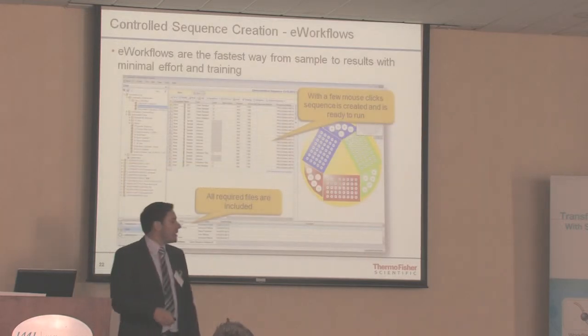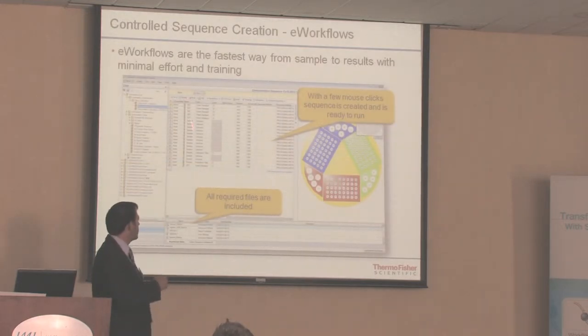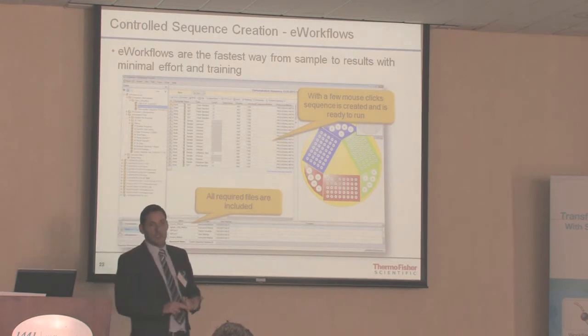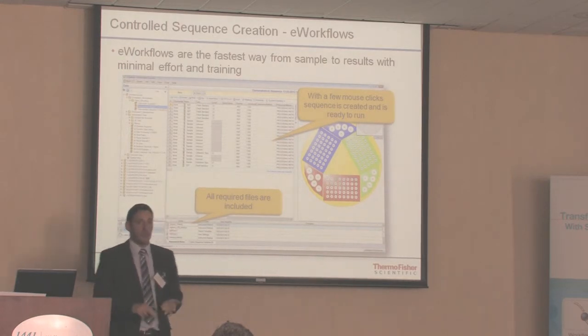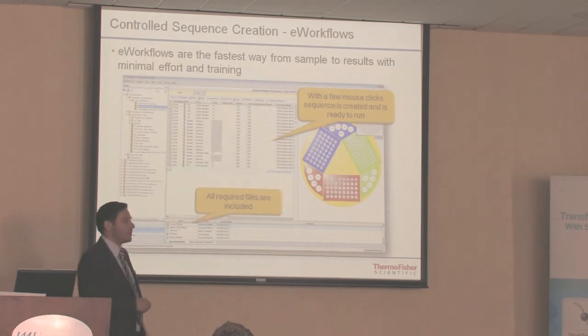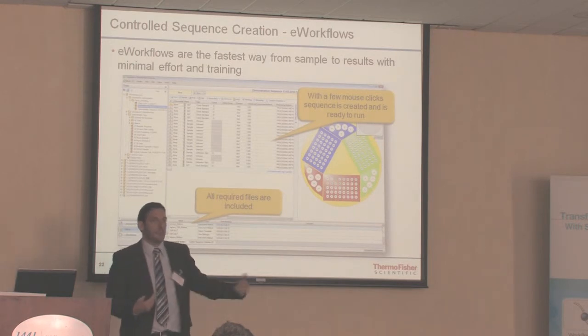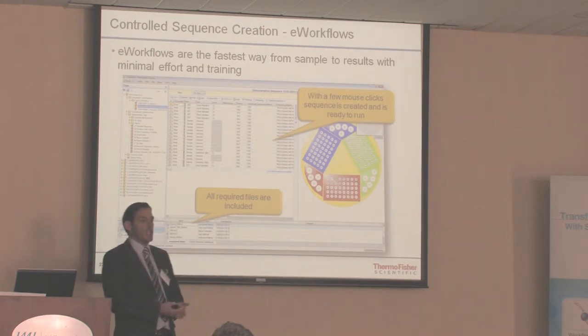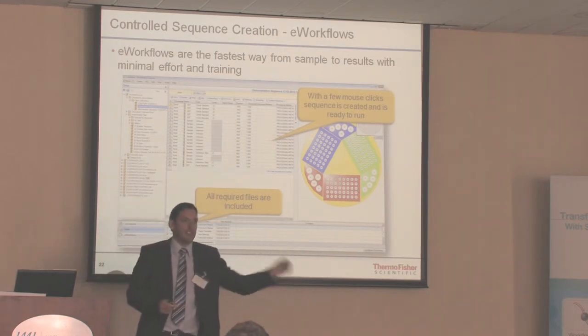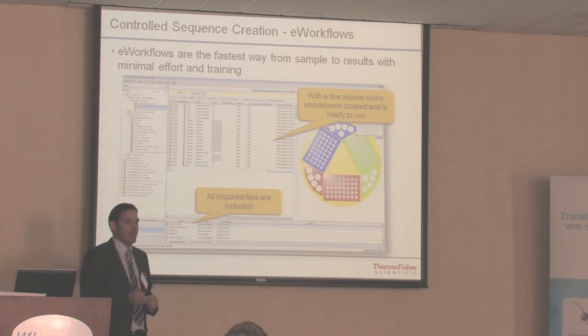What it looks like when it's finished is it generates a sequence. These are all associated files that are included there. So you would have in there a report template, a processing method, an instrument method, any attached SOPs, any Word documents, any PDFs you wish to attach to it. We can even put in some custom fields here, some actual custom calculations that apply to a sequence. All these are contained within that one e-workflow. So at the very end of it, you're going to get a result out of it. But all the user had to do was just literally, unfortunately, there is a human component. They have to remember to put their sample actually on their instrument of what they're analysing. You can't get away with that just yet.